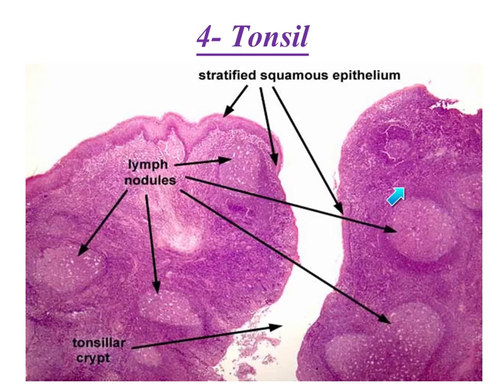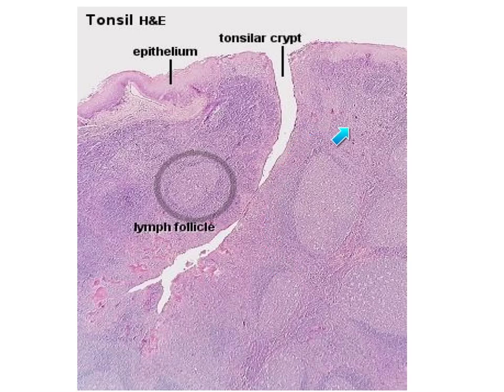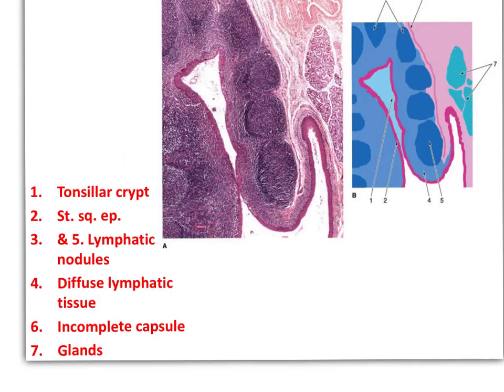Here we have lymphatic nodules with germinal centers. This is the non-keratinized stratified squamous epithelium and this is the tonsillar crypt. These are the lymphatic nodules arranged around this crypt. In between them we have diffuse lymphatic tissue formed of lymphocytes, plasma cells, and macrophages. This is a very nice picture for the structure of the tonsil.